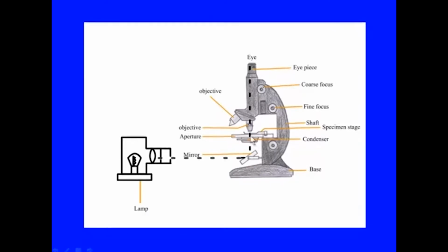The light passing from the condenser will be illuminating the object in a very small cone of light, which is focused on a very small area, and all stray or extra light is avoided by the apertures and iris, which are placed at different places.